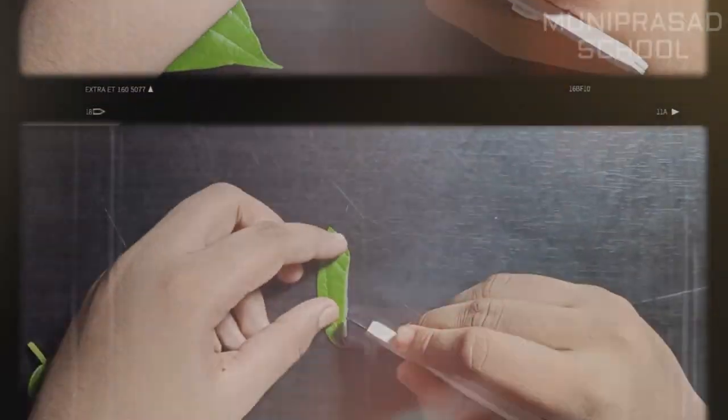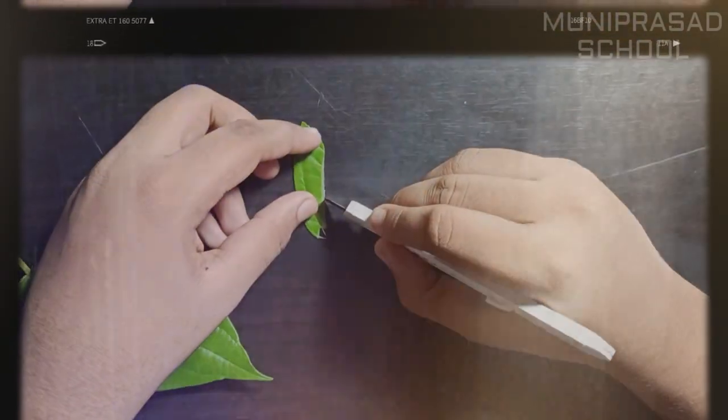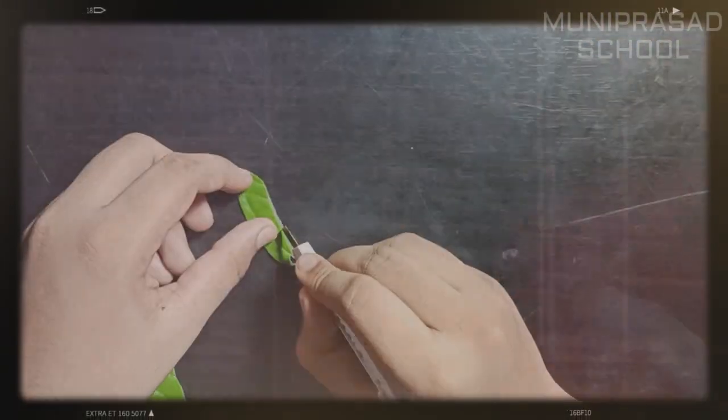Slowly remove it with the help of a knife or forceps and keep it on a slide.